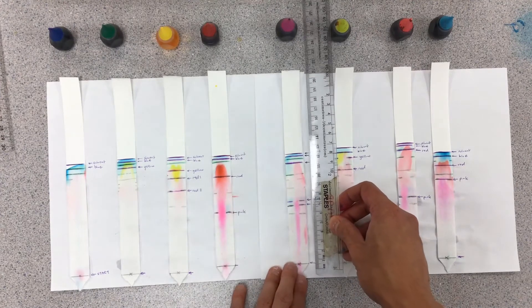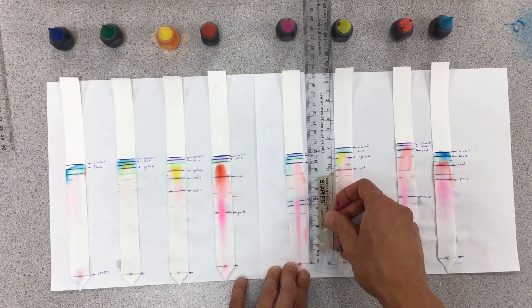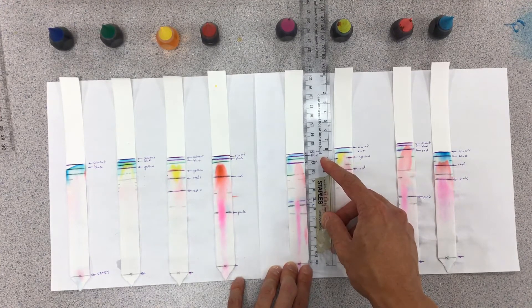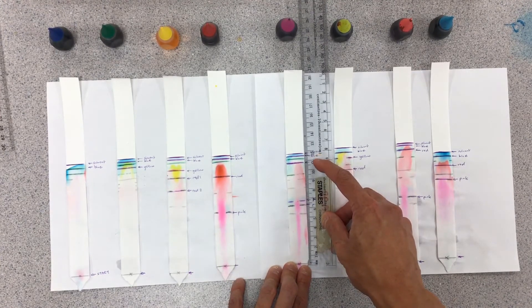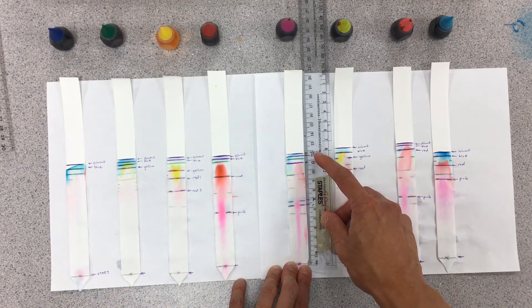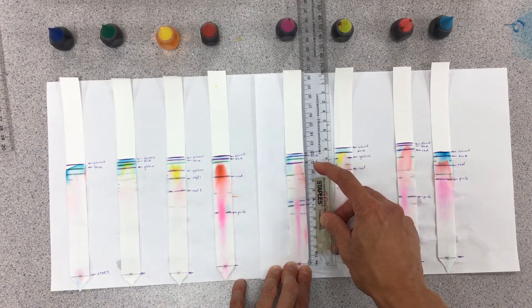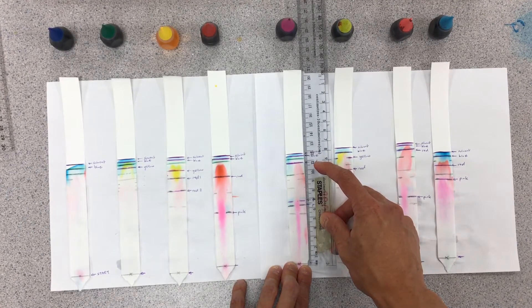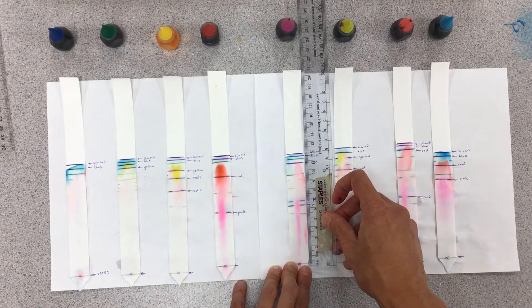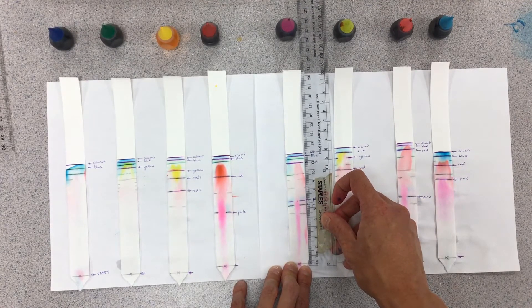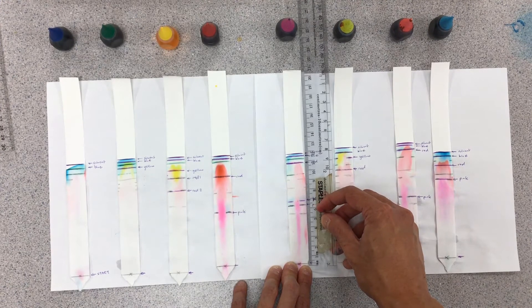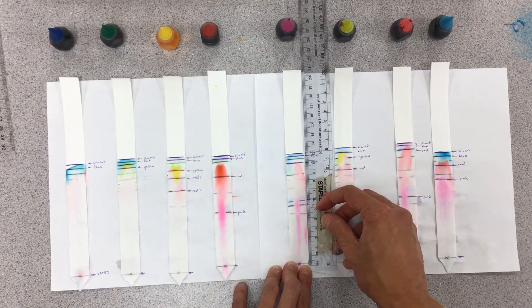Your RF value should always be between 0 and 1. One would be perfectly soluble in the solvent, it's pretty much run the race with the solvent. Here we have our solvent at about 11.8. Blue line maybe 11.5, red line about 10.8. I have another blue line, so it's possible you have multiple inks that show blue color. This one is about 6.8. The pink here is 6.4, give or take.